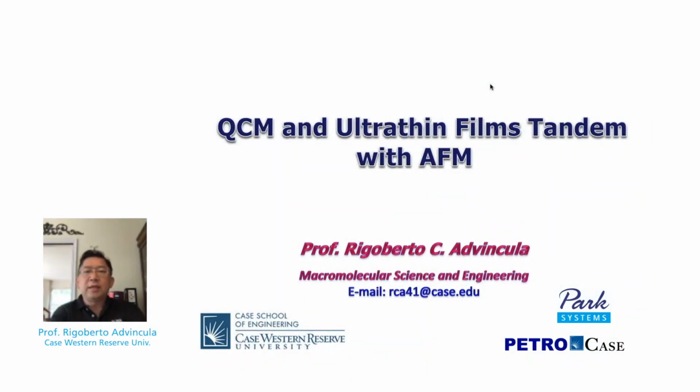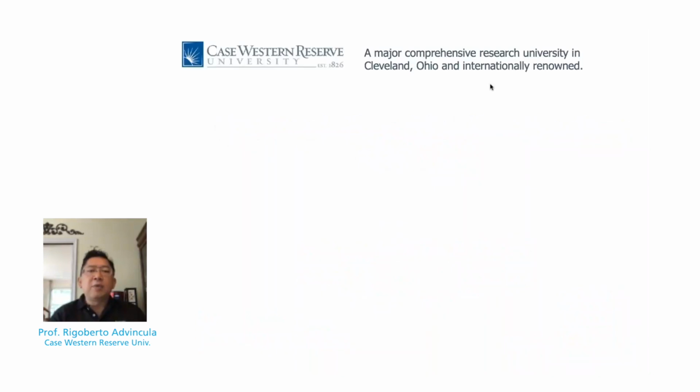Well, good morning, good afternoon, and good evening to all of you. Thank you again, Richard, for hosting our webinar today. I'd like to dive into the topic of quartz crystal microbalance, or QCM, and its application for investigating thin films, along with the use of AFM, both ex-situ and in-situ techniques.